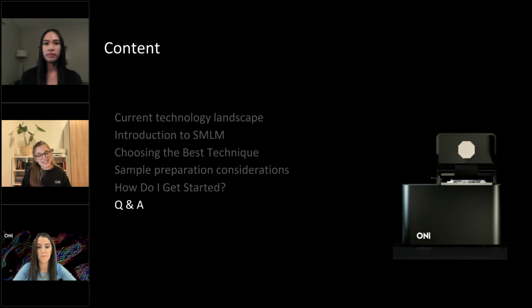Yes, fantastic experiment. I believe one of the early dSTORM research out there was actually done with click chemistry on cell membranes. And the important thing here is again the choice of dye, with Cy5 being compatible with dSTORM. So in principle, this would work with the correct STORM buffer. So once you add your buffer to obtain this photo switching behavior, this would be very compatible with dSTORM. I would say yes.